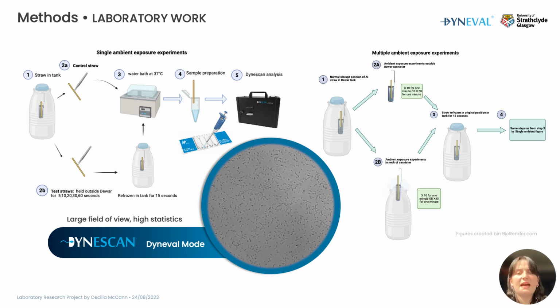So we increased this to 10 cycles of 1 minute, every time being held outside for 1 minute, and then being refrozen in the original position within the tank, shown in number 3. And then did this for 30 cycles as well to look at the impact of increasing this cycle time.